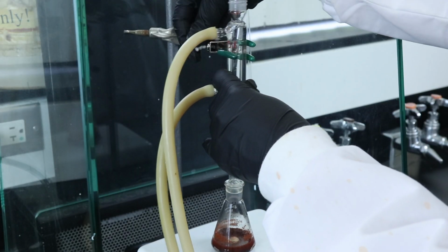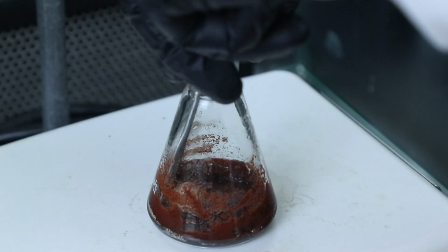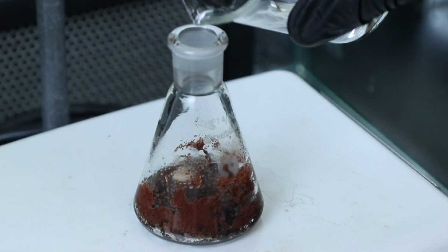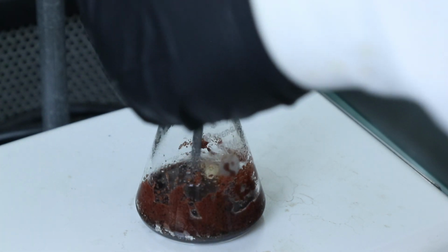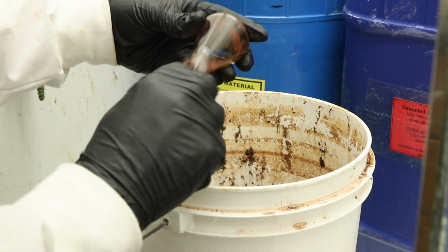Before moving on to the extractions though, I'm going to start working on cleaning up the apparatus so that the remaining cinnamon doesn't completely coat and burn onto the bottom of the flask. I'll add a little bit more water and keep it warm on the hot plate, scraping the cinnamon off of the bottom of the flask, and then disposing of it in a bucket specifically designated for the cinnamon waste.